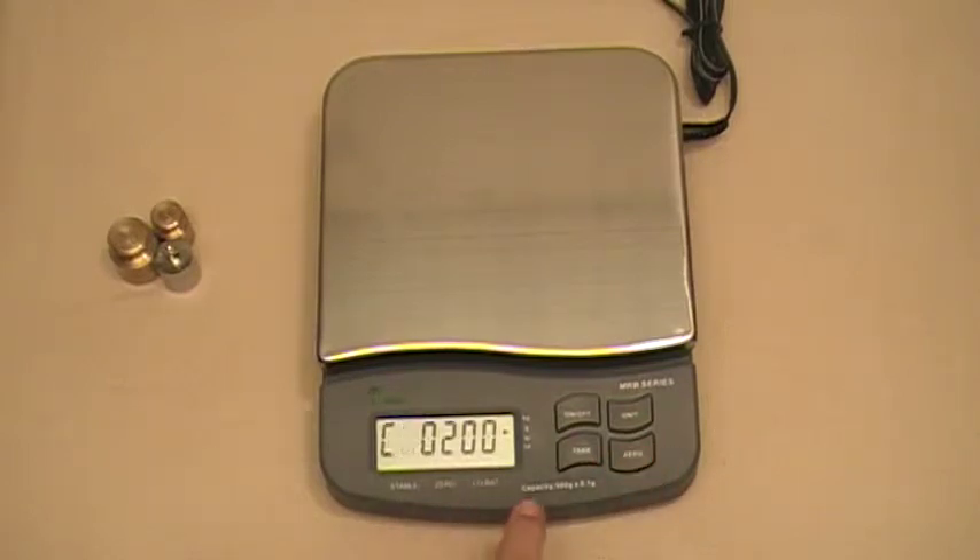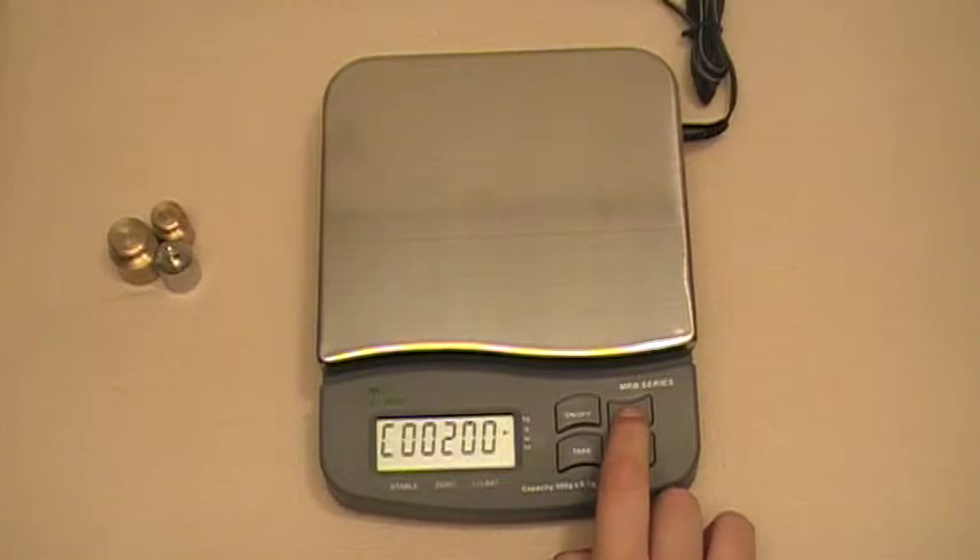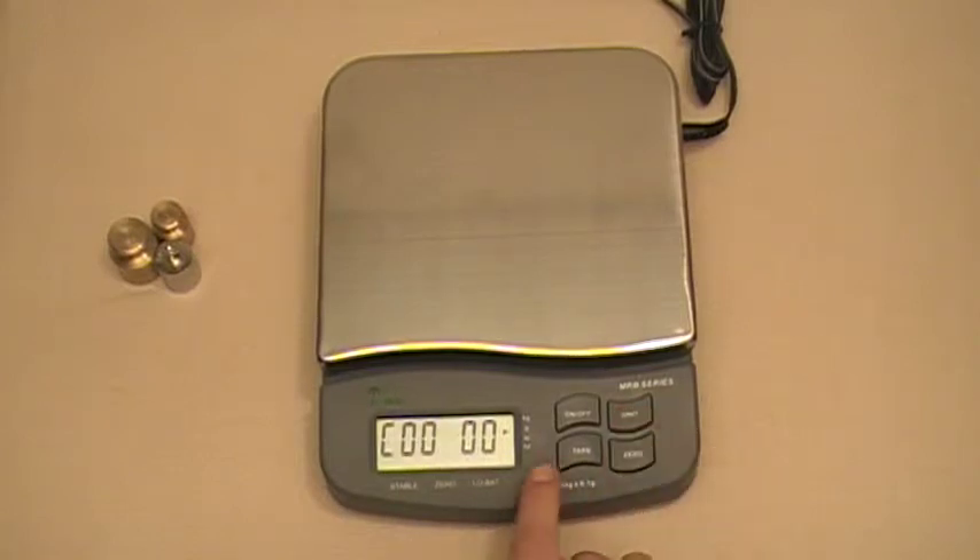Now you can select exactly how much weight you're going to be using. To move the cursor from left to right, press the unit key, and we're going to go over to 200. If you wanted to change that — say you were going to use 300 grams to calibrate — press the tare button. You can go all the way up to 9, but we're going to use 200 grams.